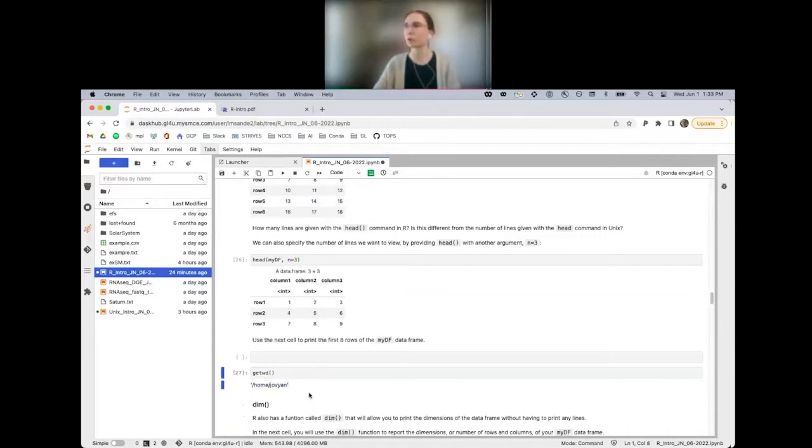And I've started recording. All right, so is anybody not in the right cell, in the right kernel, or does anybody not see that they're in their home directory?